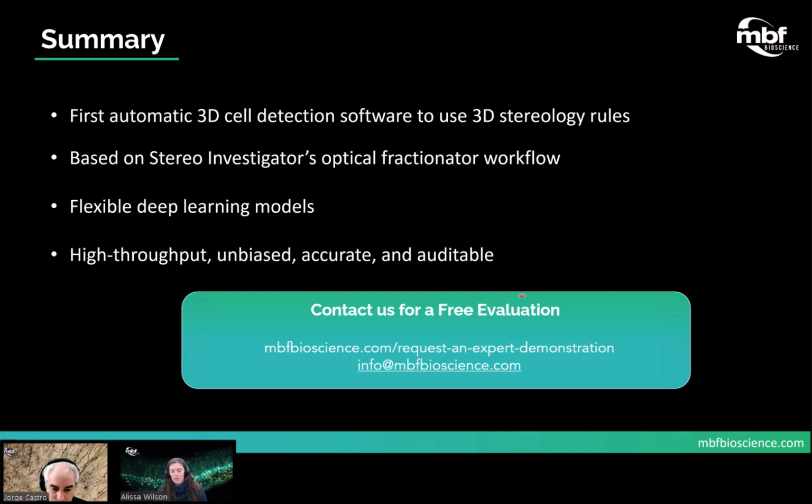Thank you so much, Jorge, for going over all of the details. And now we will get to see it in action. And I will share my screen.